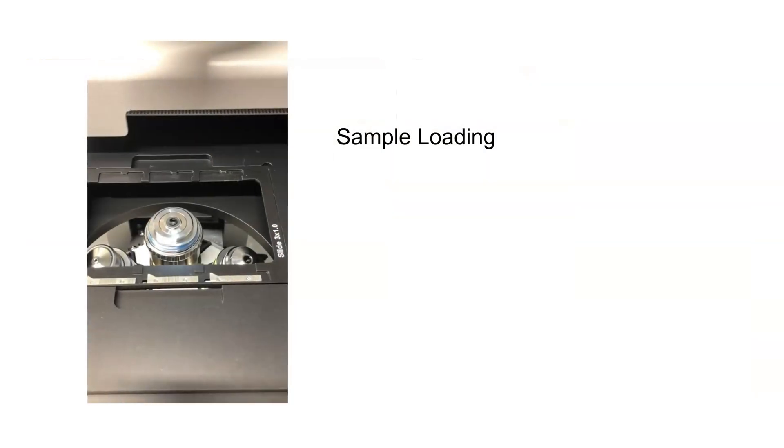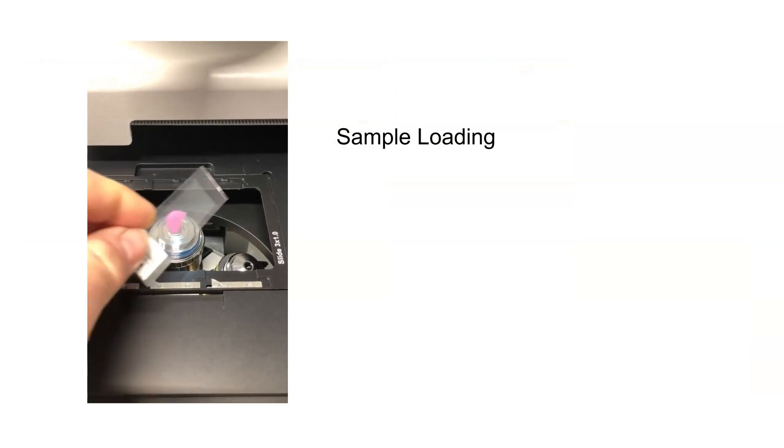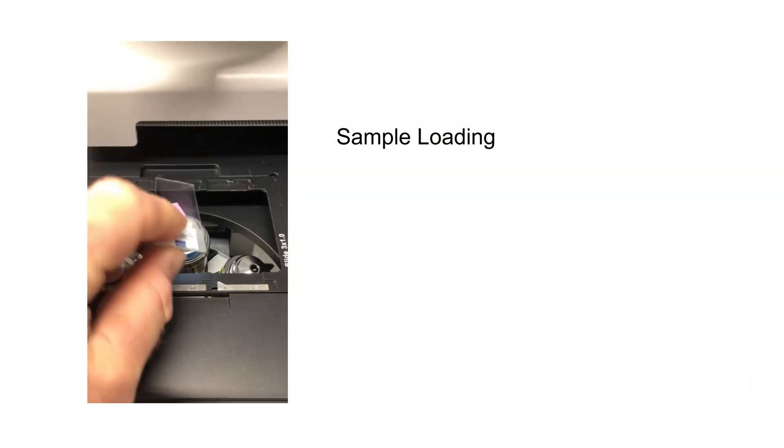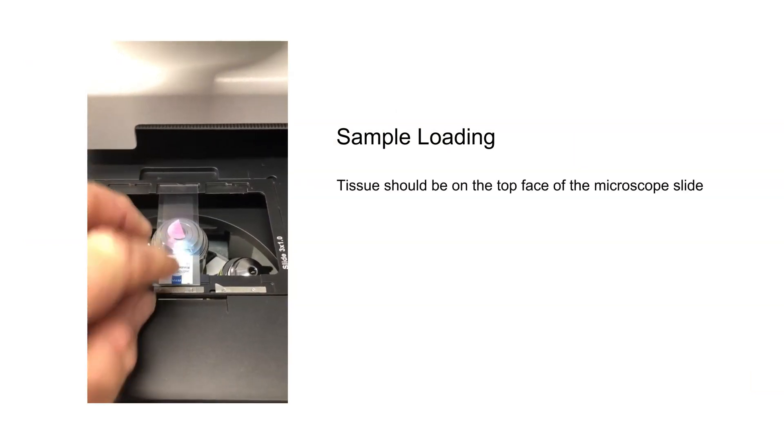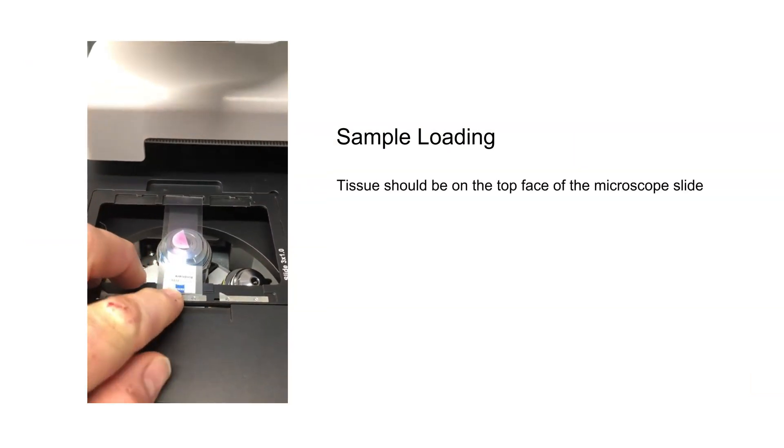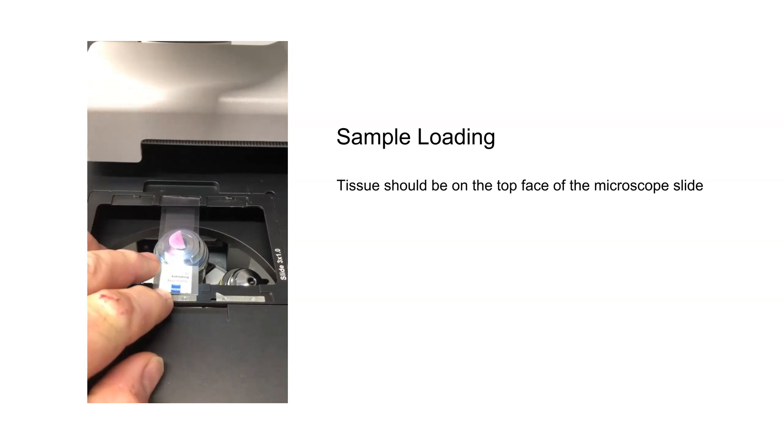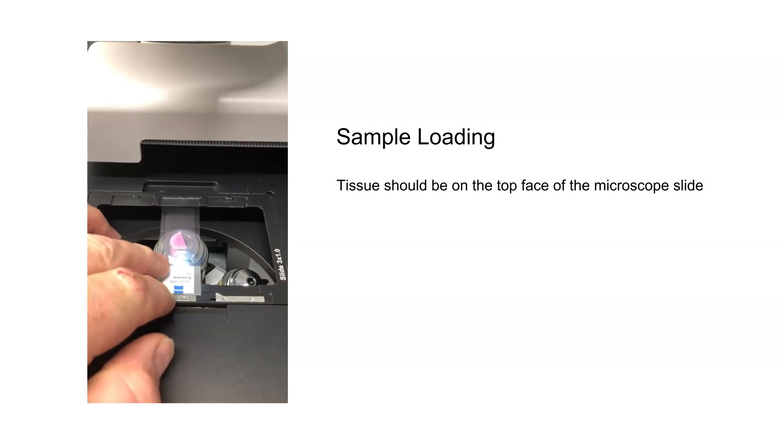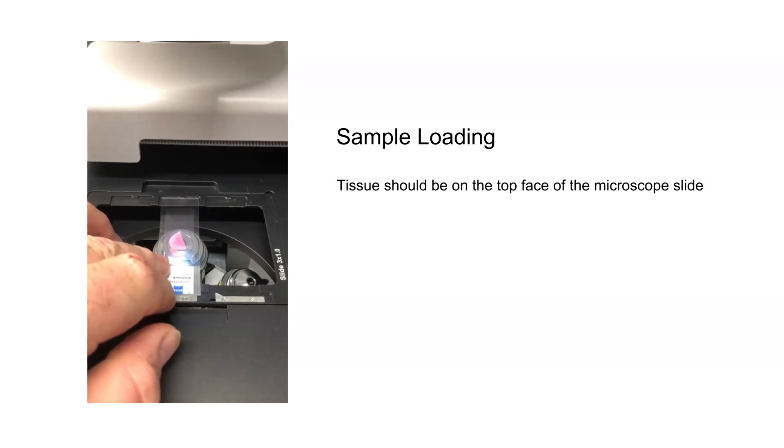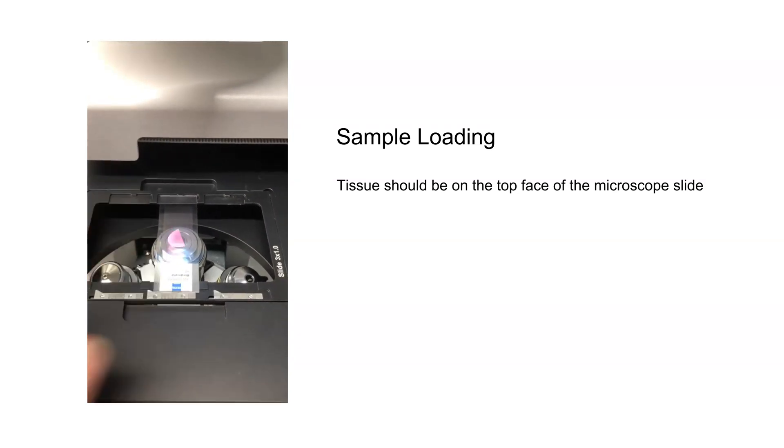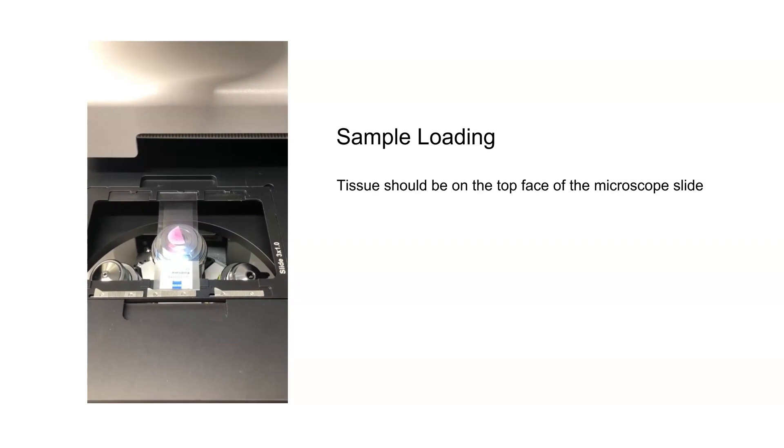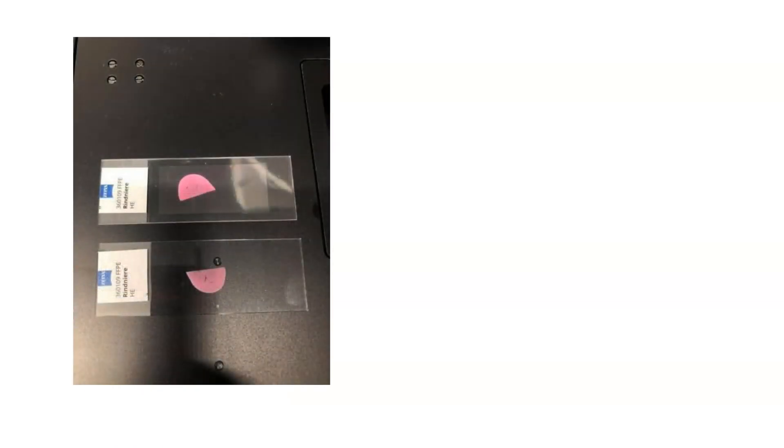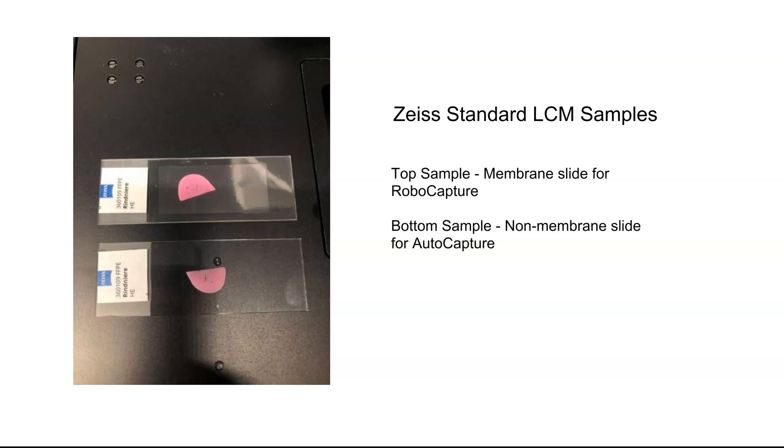You can now load your sample of interest onto the stage. Samples should not be cover slipped and the tissue that is isolated should be on top of the microscope slide when placed on the stage with the tissue facing up. Placing your sample on the stage involves holding back the spring clip in the position of interest, then placing the slide and releasing the spring clip. Your system was delivered with some standard slides prepared by Zeiss Labs. If this is your first time using the Palm LCM, I suggest you start with those samples.